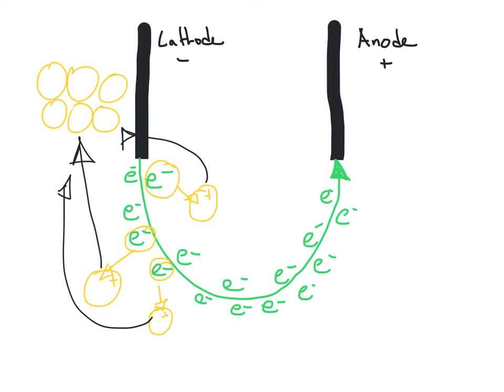On the anode side, what we saw was gas bubbles forming. Those gas bubbles were actually chlorine gas. The reason for that: the chlorine had a negative charge, and therefore it was attracted to the positive side of the electrode, or the anode.